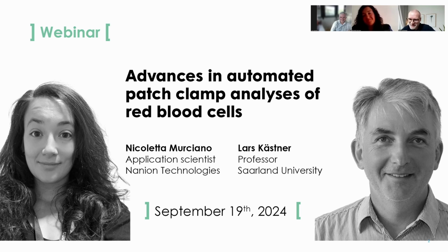Okay, we have a question from Tom, a question to Lars. With a resting membrane potential of -20 millivolts, would CaV1.2 not be fully inactivated? I'm not familiar with its biophysics, and would it recover from inactivation when Gardos hyperpolarizes the membrane? Yeah, exactly. This is the idea.